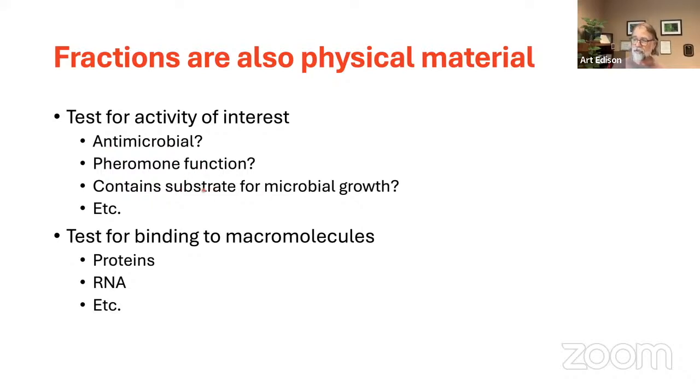Maybe this is an organism that would be supporting growth for another organism, like marine phytoplankton releasing material to support the growth of marine bacteria. Maybe you could see what in that phytoplankton is a substrate for bacterial growth, and the list goes on. Whatever biological question you want to ask, you could come up with some sort of test that would become your assay.